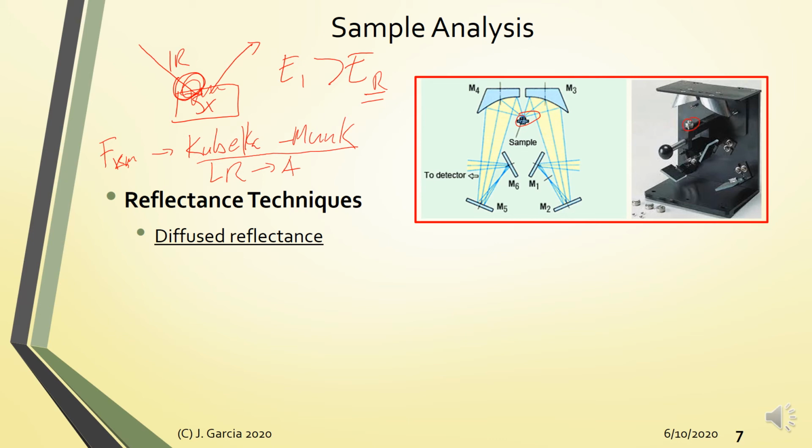Alright, now the trick here is to ensure that you evenly place your powdered sample onto the sample cup, and make sure to level it.